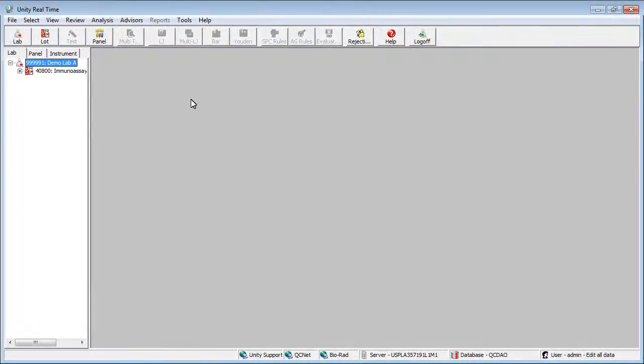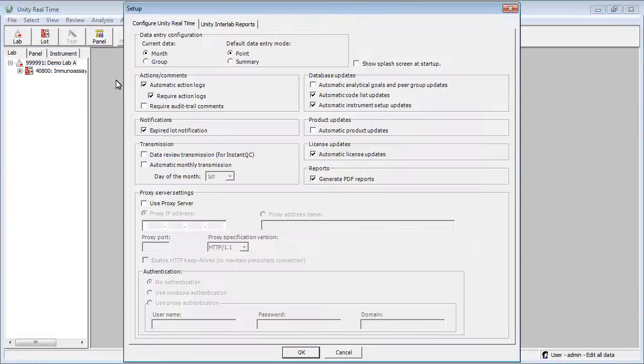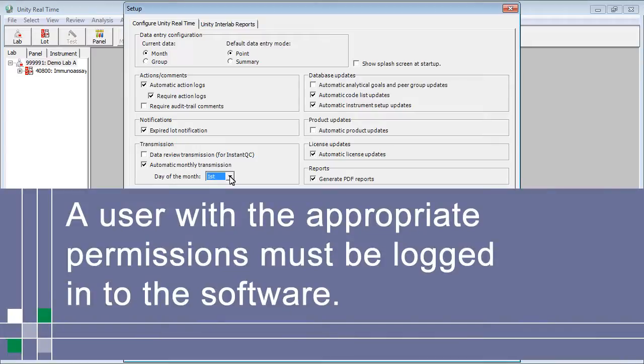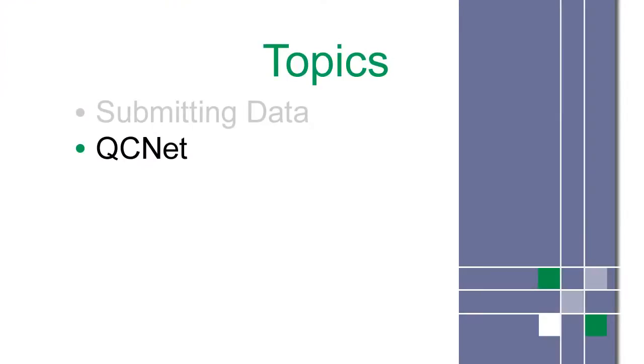To set this up, click Tools and Setup, select Automatic Monthly Transmission, and choose the date you want the software to submit the data. For this function to work, a user with appropriate permissions must be logged in to the software.